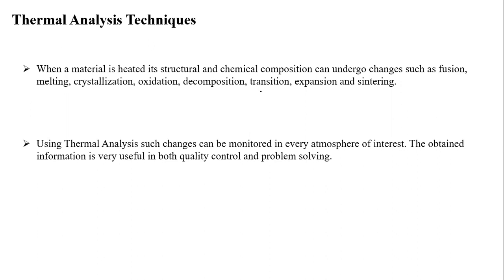In this type of analysis, we go for thermal heating, and we will see what kind of changes are happening in the present given pressure and temperature, or present environment and atmosphere. This type of analysis is very useful for quality control. We can see how much quality is there; the quality of the mineral we can judge. And also, is there any other problem? We can judge that problem also. Now we'll see in detail the thermal analysis.